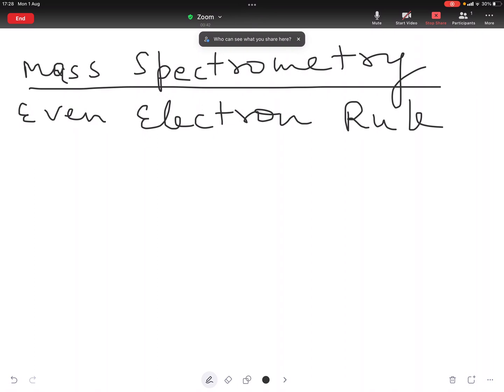This rule predicts the most likely sequence of ions. It states that an even electron species will not normally fragment into two odd electron species, since the total energy of this product mixture would be too high. In preference, an ion will degrade to another ion and a neutral molecule.